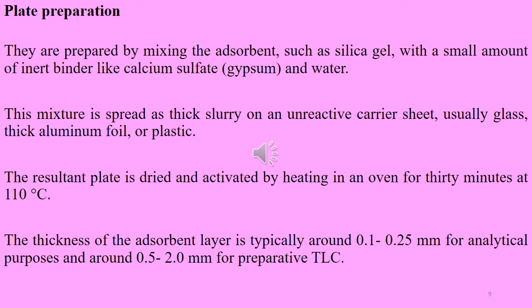How to run a TLC plate. First, prepare the developing container. The developing container for TLC can be a specially designed chamber, a jar with a lid, or a beaker with a watch glass on the top.